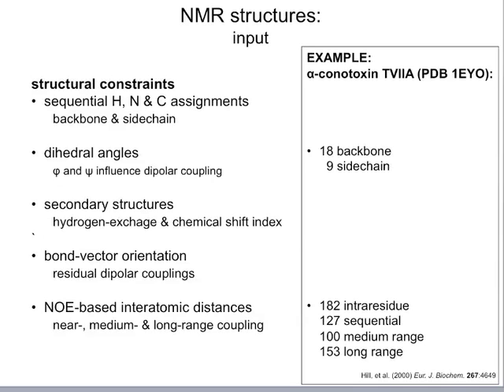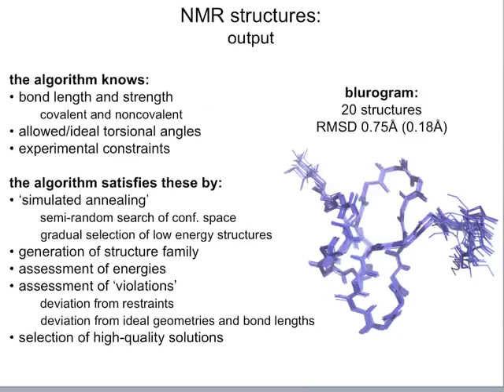And then, they didn't use these other methods in this structure solution, they used these NOEs. Some were within a particular residue, but for those NOEs or interactions that were between different amino acids, we see that it's only a couple hundred or a few hundred constraints that we give our model building program that allows us to come up with our structure.